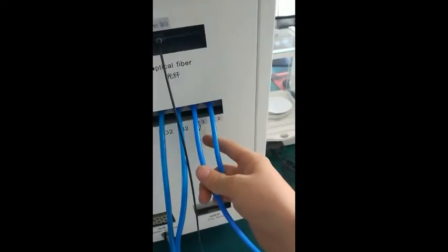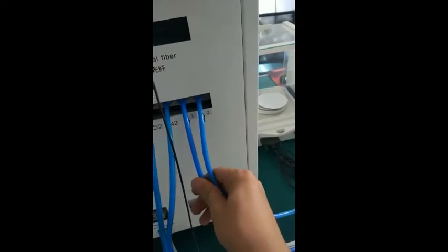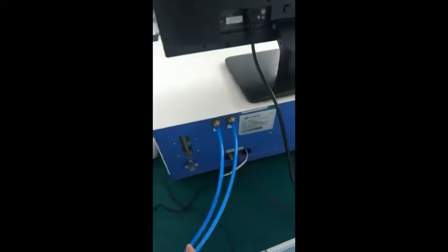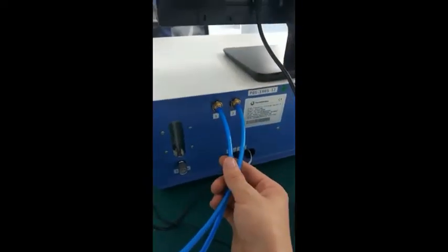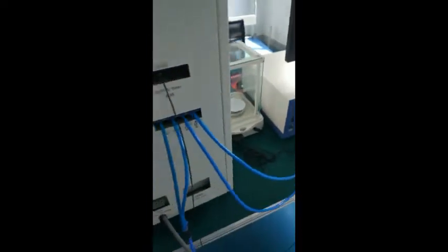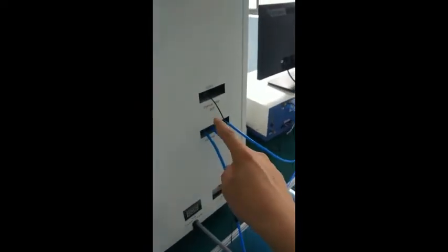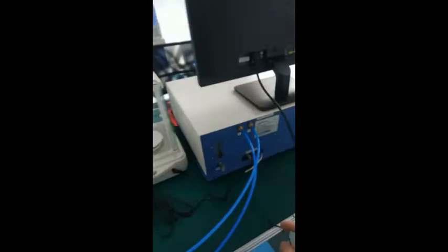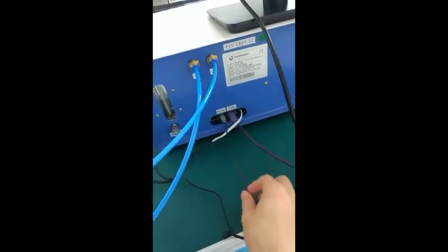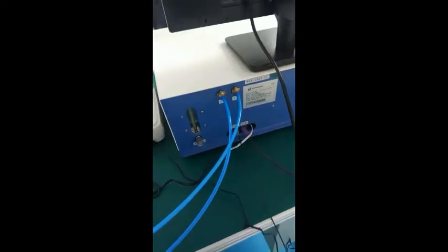Through the sign, we can see that one of the two blue gas pipes on the right is the air inlet pipe and the other is the air outlet pipe, which are marked as number one and number two respectively, which are connected to the number one and number two interfaces of the analyzer.